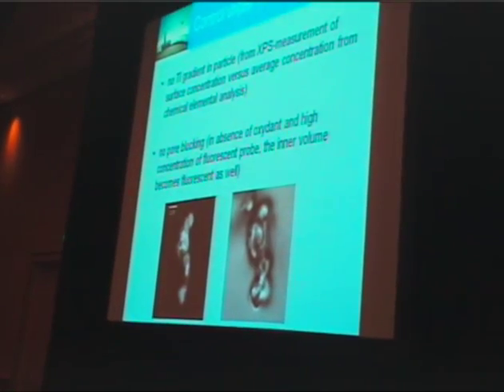There's also no pore blocking, so in principle the probe would be able to reach the inner volume of the particles. This we confirmed by doing actually the same experiment, adding the fluorescent probe to the particles, but in the absence of the oxidant. And if you apply excessive substrate, then you really see that also the inner parts of the catalyst become fluorescent.